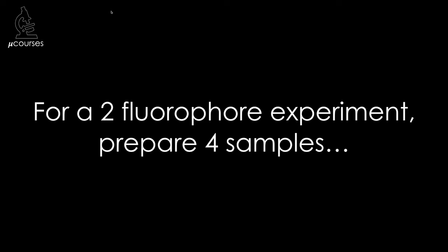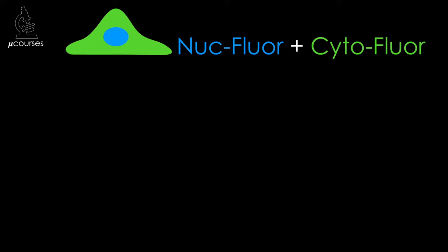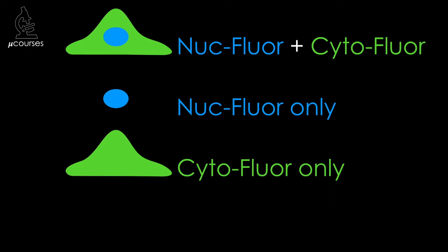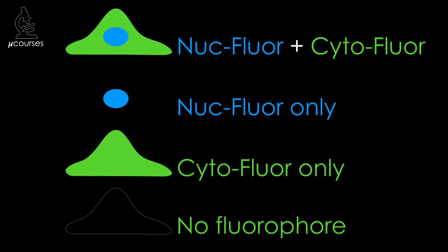To perform the necessary controls for a specimen labeled with two fluorophores, you should prepare four different types of samples. First, the experimental sample labeled with both fluorophores — in our example, nukeflor and cytoflor. You also need a single-labeled control with only nukeflor, and a single-labeled control with only cytoflor. Both controls should be prepared using the exact labeling protocol used for the experimental sample — just leave the fluorophore out. Biological samples can also contain autofluorescence, so include an unlabeled control to check for any detectable autofluorescence.